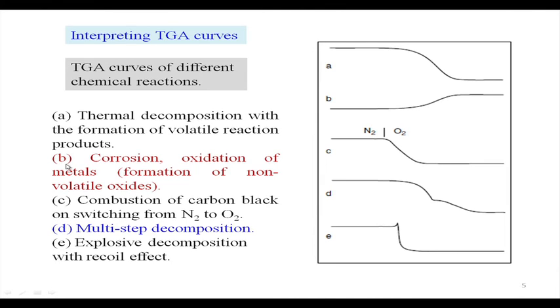The second one, what we have seen, is typically a weight gain process after some time, that means after a certain temperature. So, what we see can be a corrosion study. Metallurgists or metallurgical engineers do study the corrosion experiment on some samples, whether a sample in a particular environment is getting corroded at some temperature, because temperature-assisted corrosion can be studied for samples, say some iron nail or iron sheet or iron slab.